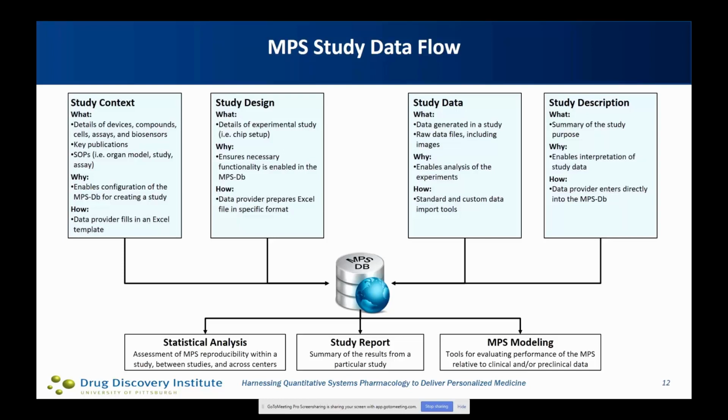Then for each study there's a study design that defines what the treatments are, how many models are being used, what the timing is of treatments, and all of those important factors that you need to know in order to be able to interpret the results of the data. And so we capture all of that in the database.